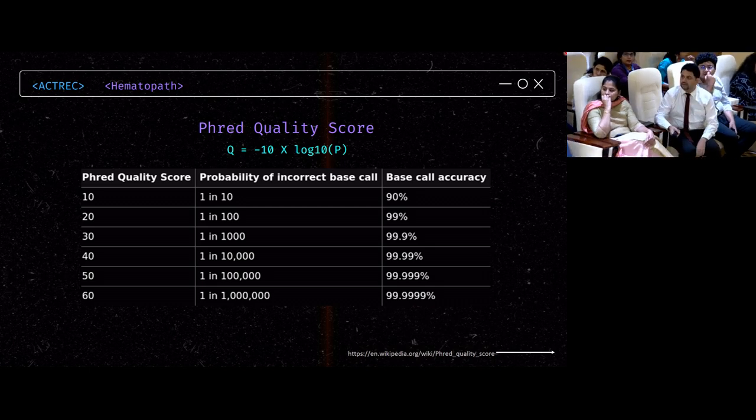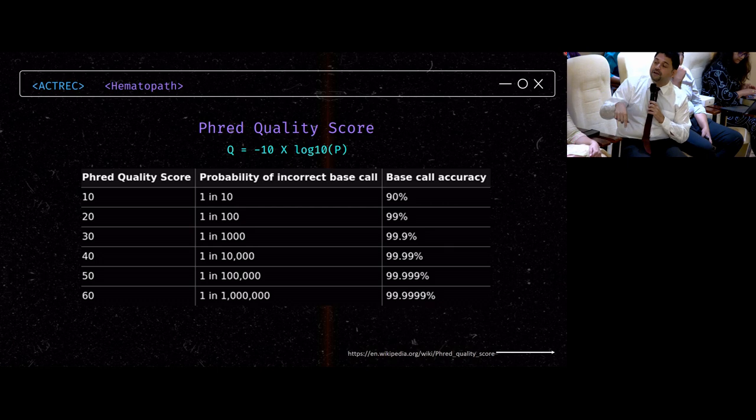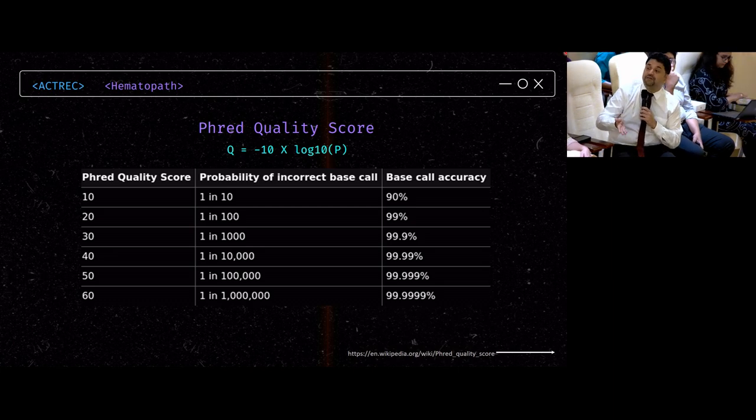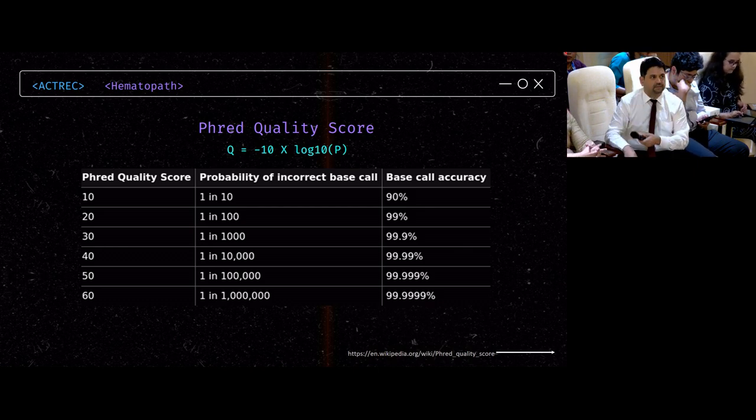So library, obviously we do the quality check. That thing may be good, but if you have used any ancient DNA, it's not going to be of good quality. So there are many steps involved in this. Generally the library prep process was good, but if the sample quality itself is horrendous, you're not going to get good results. So there are ways to offset it. You can do UMI. You have to do many X coverage. So that will help remove some of these errors.